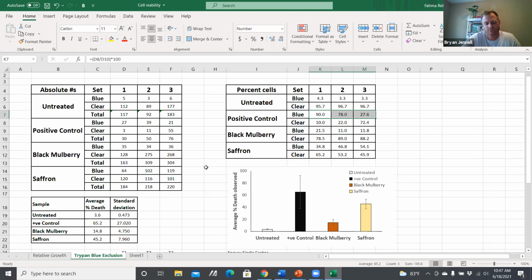Okay, so yes, there are many tests that we are already aware of, right? You know the ANOVA, the chi-square, and the t-test. So let's think about the simplest of them all, which is the student t-test. Can we run student t-test to look at the entire data set, all 4 samples together, to see if there is something significant, some different changes in there? Why not?